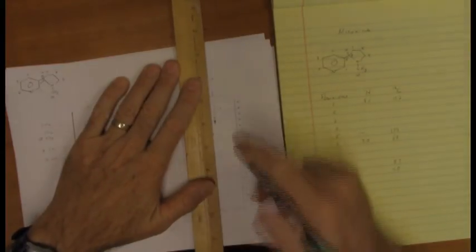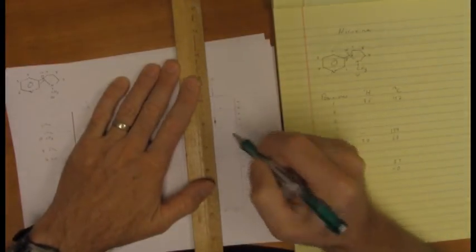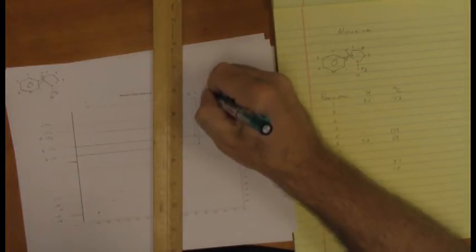Okay, and if I do this one and line it up very carefully, there it is. There's the other one. I'm going to call that position 9, and I'll put a little prime on it to make it different from the other one. Looking carefully at the chemical shifts, and that is sometimes easier to do on the proton spectrum, there is position 9, there is position 9 prime. And looking at it carefully, that looks to be right around 2.25 ppm. So there is position 9 taken care of.